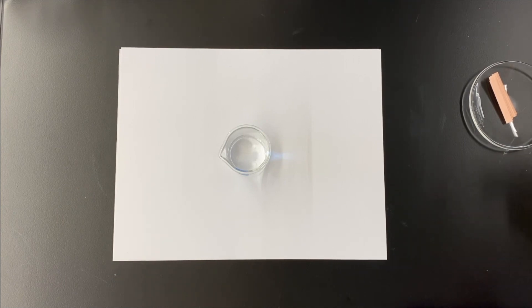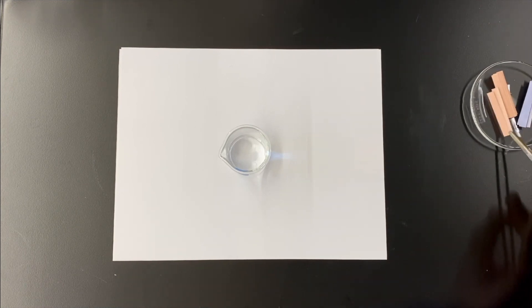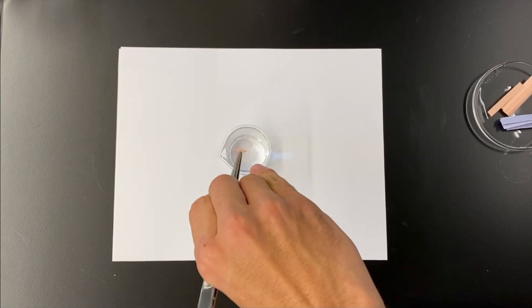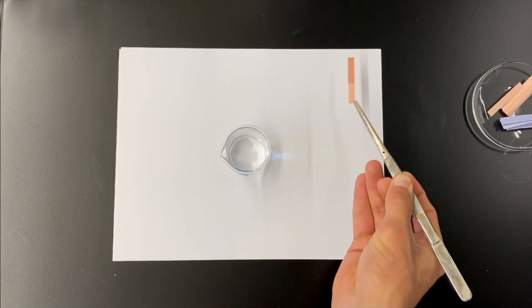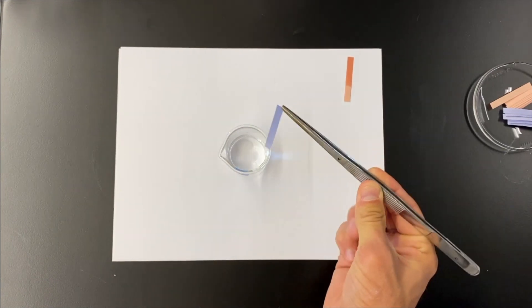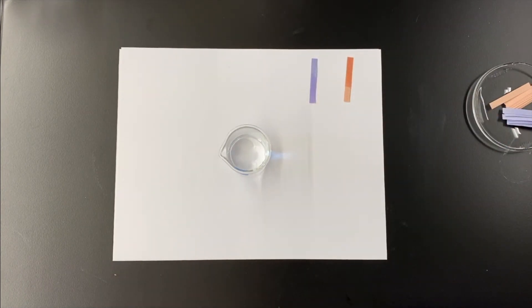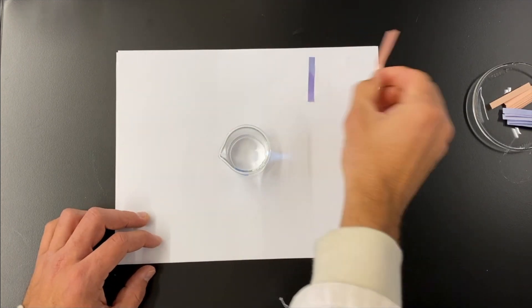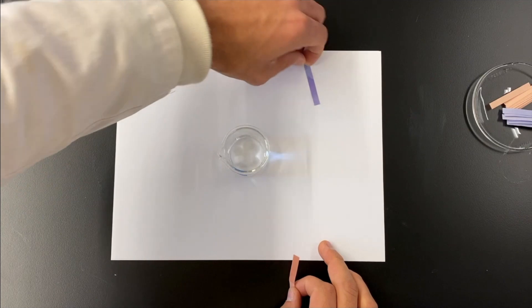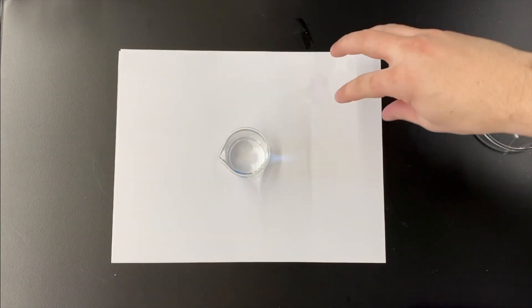Do you think water is acidic or basic? That's a tough one. So red is staying red, and blue is staying blue — no surprise there. Neither acidic nor basic. So what does that mean? It's neutral. So if I had to put a number on that, that's up to you guys to decide. We're between 1 and 13.